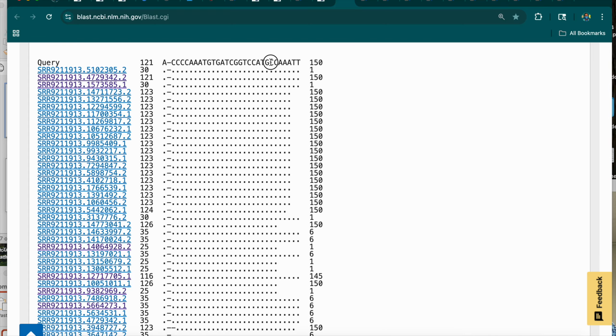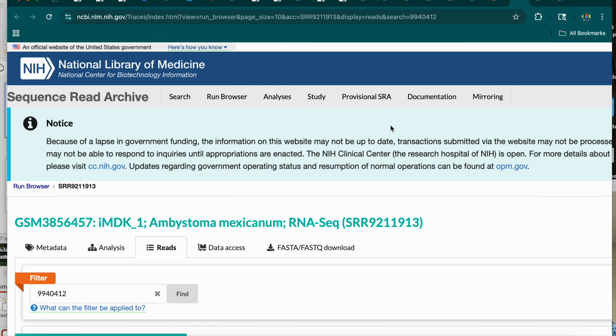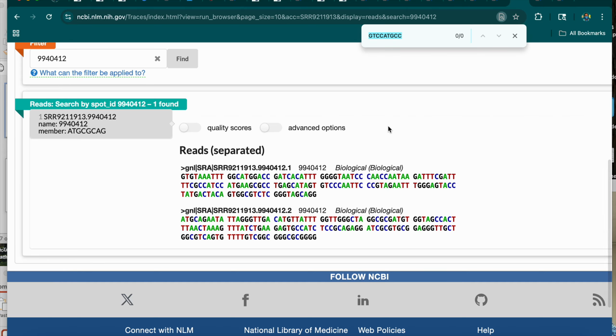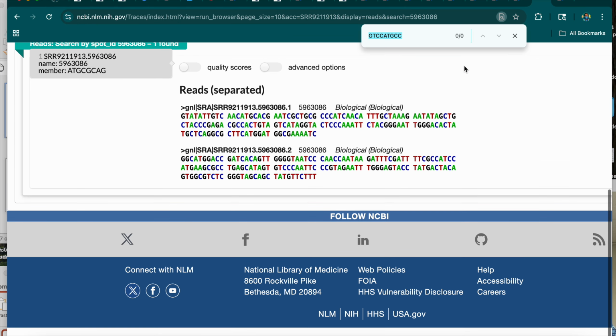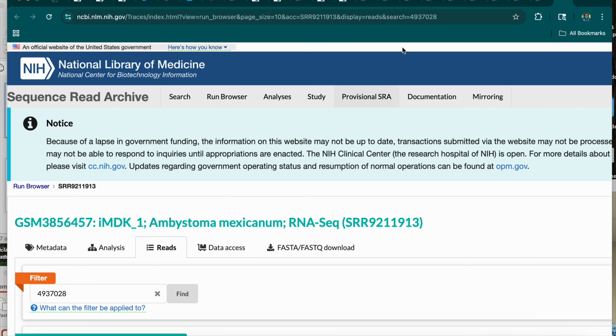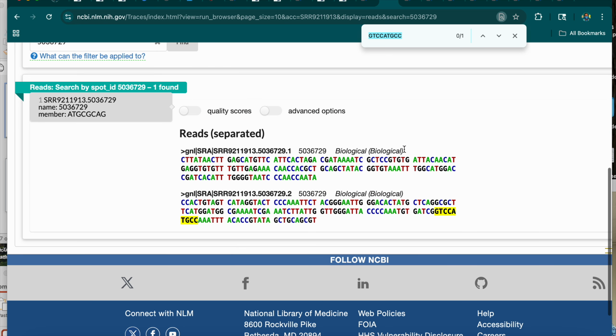All right, so now let's just pick this sequence, and we can just search for that. Find, paste. Okay, that's not one of the ones I just opened. Okay, I did something wrong. Oh yeah, it's one of these, sorry. Oh, there we go.